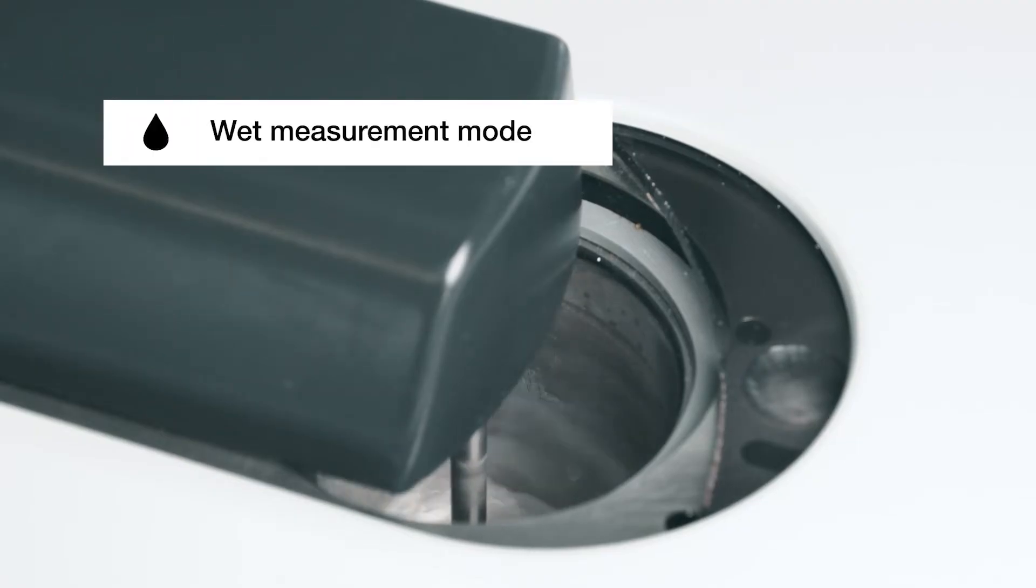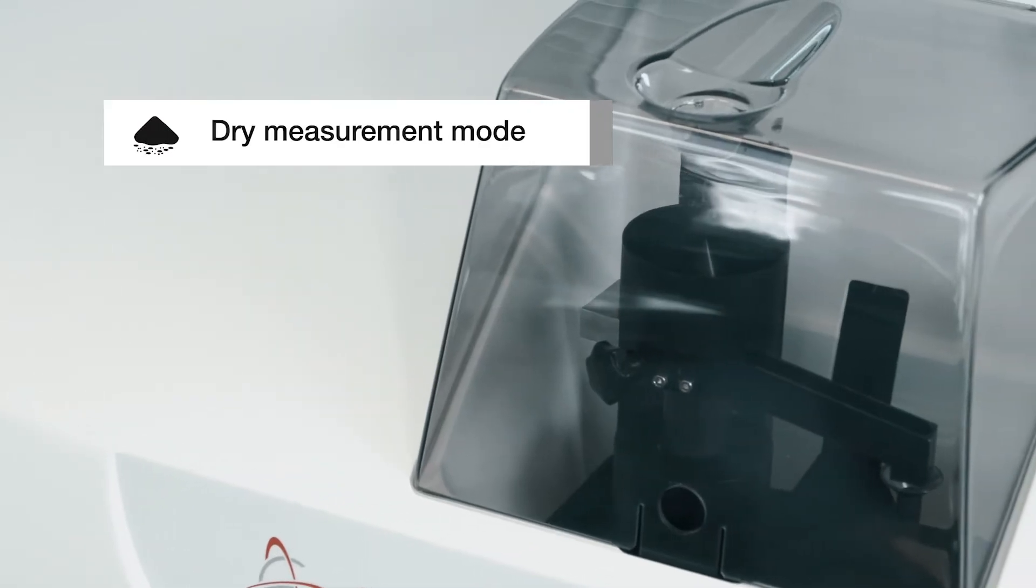PSA can perform wet measurements of either liquid or dry samples or dry measurements of dry samples.